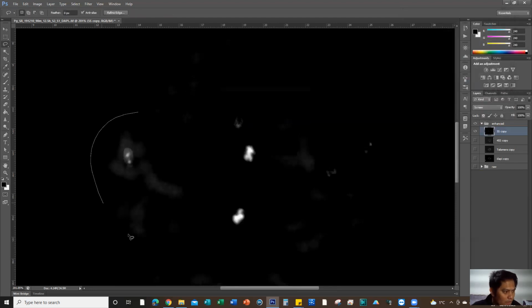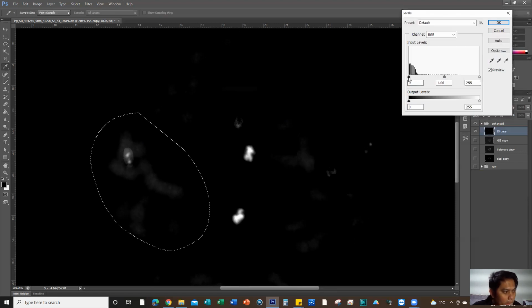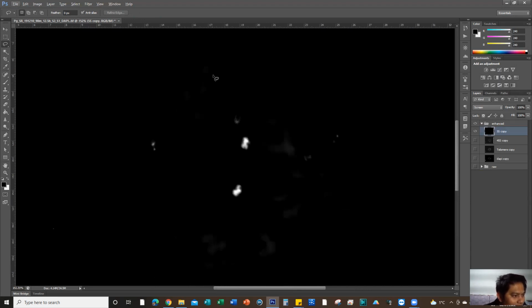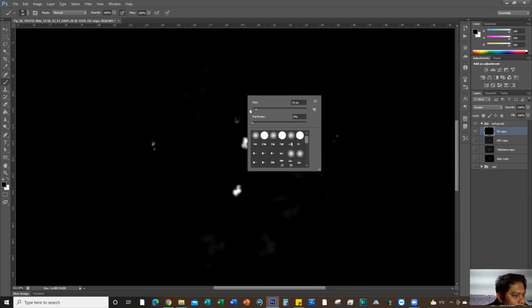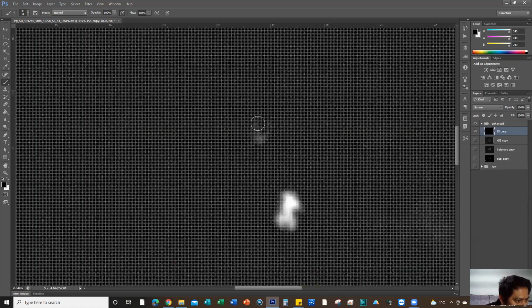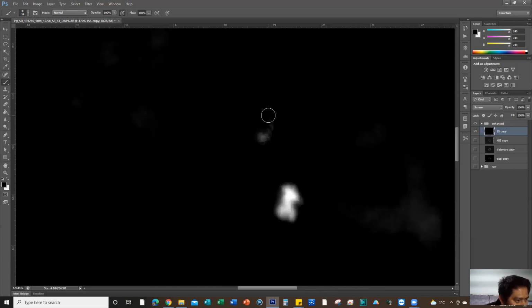And this one too. Okay. So you now have this clear signal of these 3 pairs of signals. I want now to remove the other background here. So how to remove? You can also use the brush tool. Click the brush tool, right click, and then zoom in. I want to remove this area I don't like. These are just like the noise.